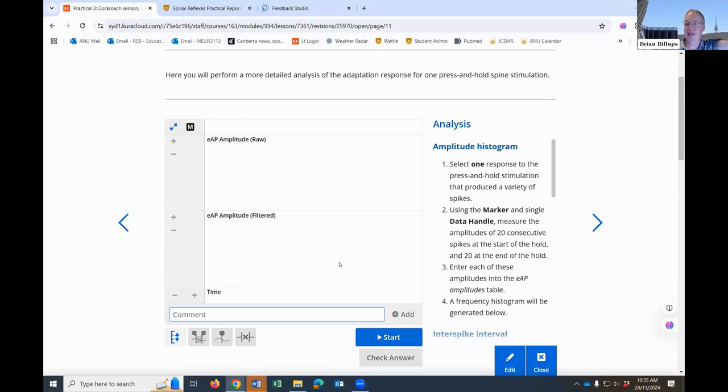And the system is set up so that it averages 100 flashes. And some of them are great and some of them are not so great. But we always have that sample data in there. And if a student collects a lot of data, then they can't access the sample data. So then I run another lesson, which is called the sample data lesson. I give them access to that. They can go in, they can get the sample data, and then they've got something to measure.